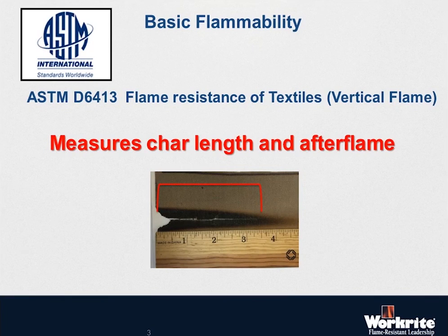So you measure the char length, you look at the after flame. Those are the two basic criteria used for this ASTM D6413 test method to determine whether or not a fabric is considered flame resistant. Once you've crossed that hurdle, then fabric manufacturers can move on to do the other testing more specific to the particular hazard that they're developing the fabrics for. So that's first level, basic. Is it flame resistant or not? You'd use the D6413 vertical flame test.